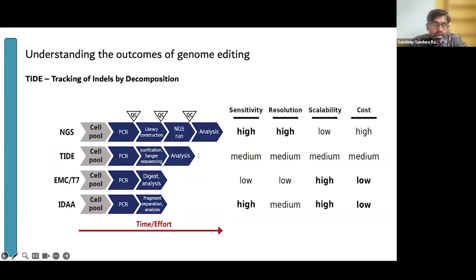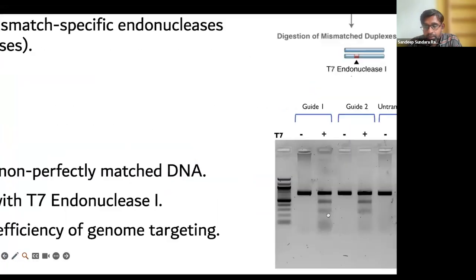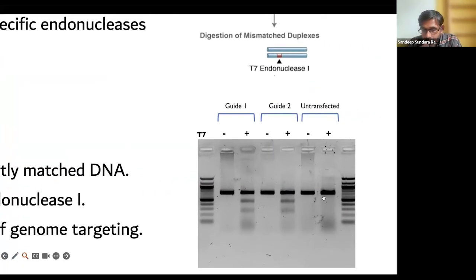Absolutely, they can be quantitatively assessed. Let me go back to my slide so that I can explain a bit more. Thank you, Cassandra, for catching that. So in this gel, if I zoom in a bit on my presentation, one thing you can do is quantify your PCR products before loading onto a gel.